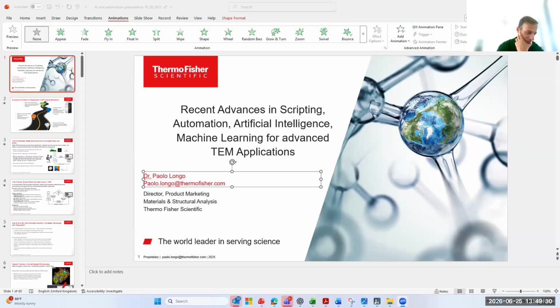I think they were doing EELS across nanoparticles, but only across the edge of these nanoparticles, where the sample is thinner, so more suitable to EELS. It's already possible to do that through an external server, and that external server also controls Gatan as well as ThermoFisher.